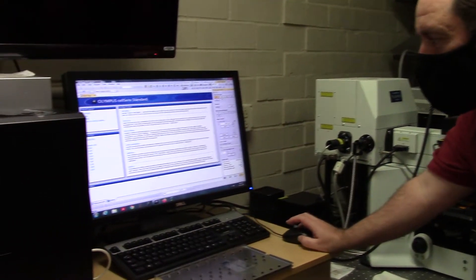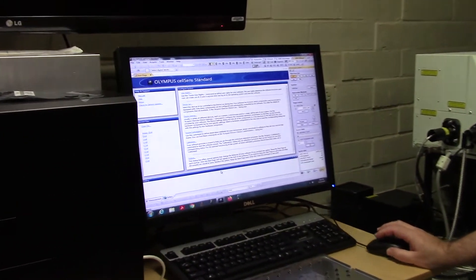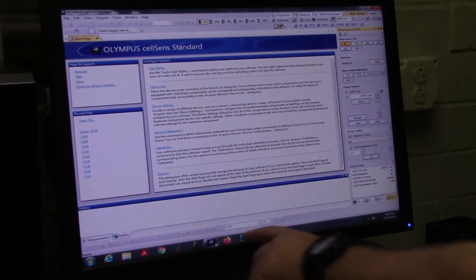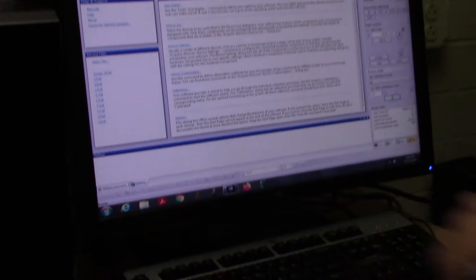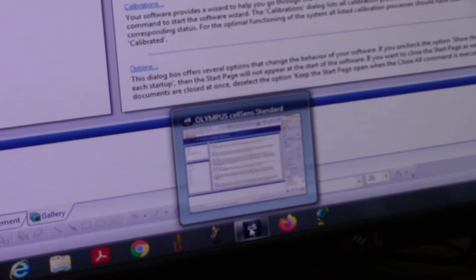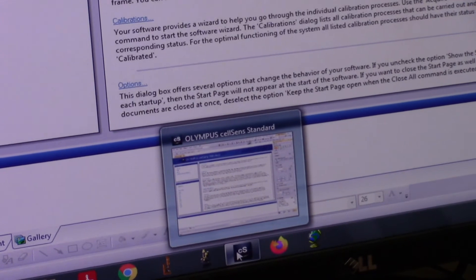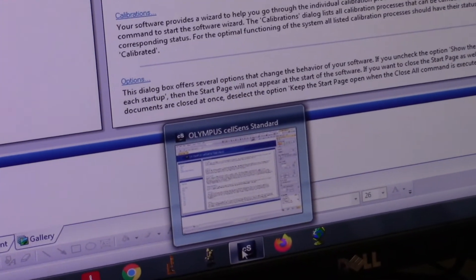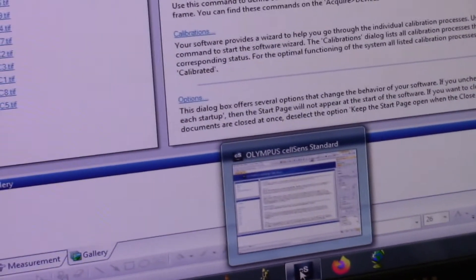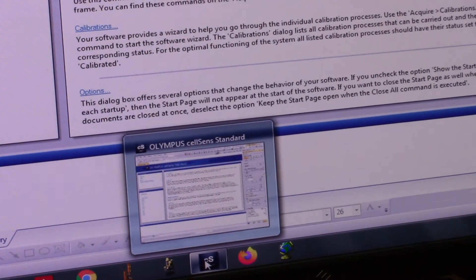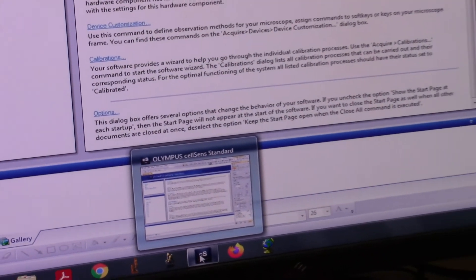I've logged onto the computer here and I've opened this program at the bottom here — CellSense Standard. We're gonna sense what's going on in our cells, it's gonna make sense, perfect sense. We're gonna learn a lot of science.